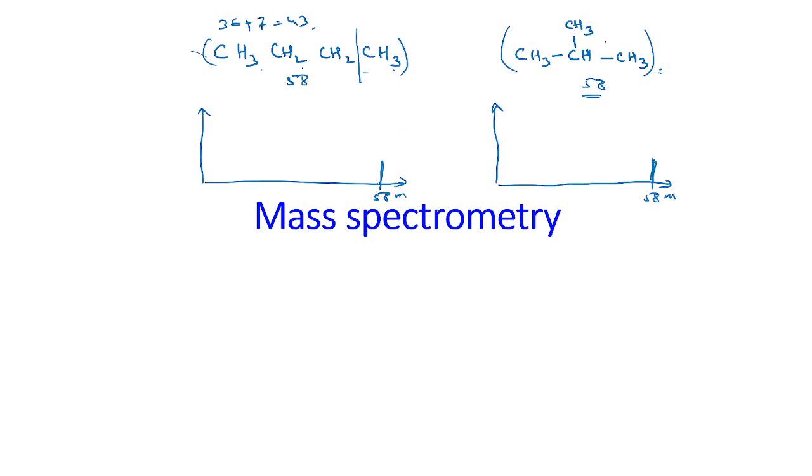Here also we will be having 43. So at 43 we will be having the peak.